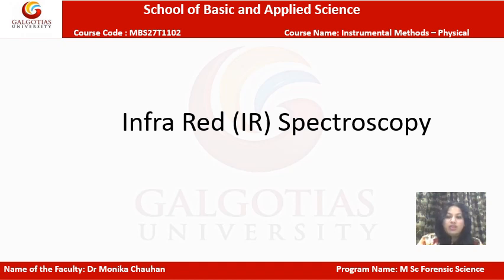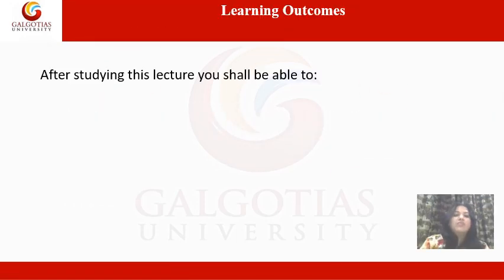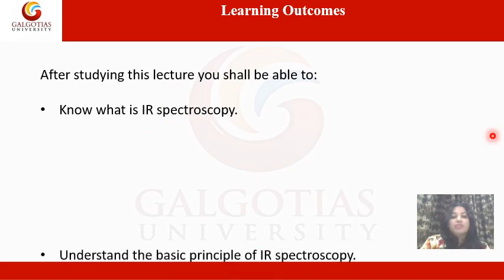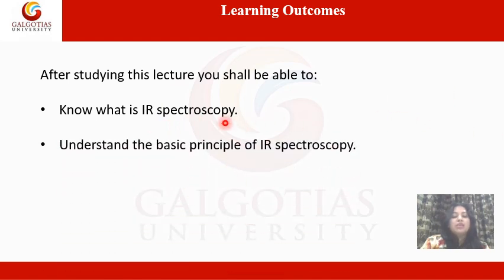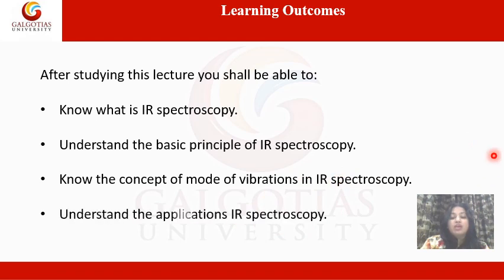Hello everyone, I am here to discuss basic concepts of infrared spectroscopy. After studying this lecture, you shall be able to know what is IR spectroscopy, understand the basic principle of IR spectroscopy, know the concept of mode of vibrations in IR spectroscopy, and understand the applications of IR spectroscopy.